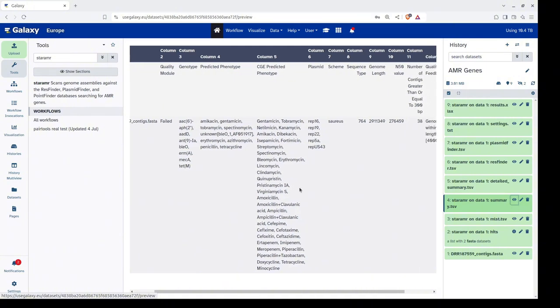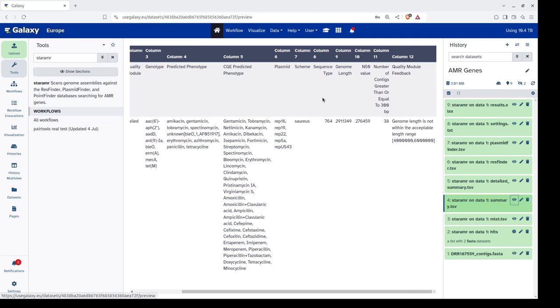The predicted phenotype column forecasts drug resistance based on the genotype. Additionally, the CGE predicted phenotype from the Center for Genomic Epidemiology provides an alternate prediction. The plasmid column lists any identified plasmid types. The scheme column shows which MLST scheme was used — MLST stands for Multilocus Sequence Typing, a method that characterizes microbial species by analyzing several housekeeping genes. The sequence type column combines allele types to assign a sequence type. Other statistics include genome length, the N50 value, and the number of contigs longer than 300 base pairs. The quality module feedback provides detailed information on the genome's quality metrics.